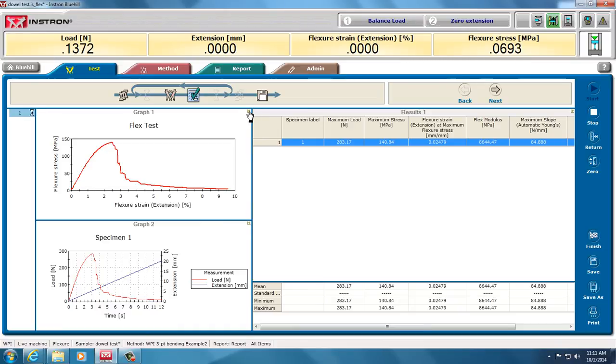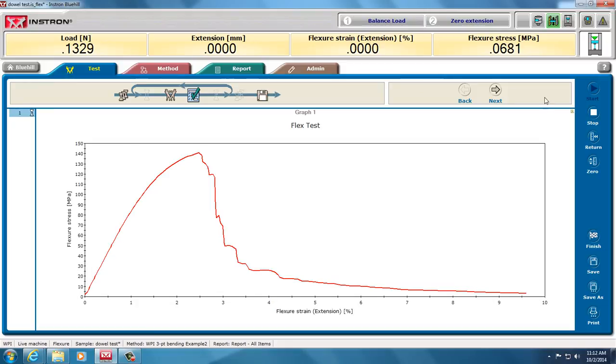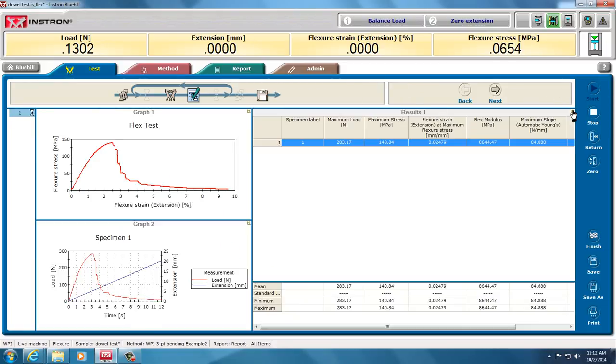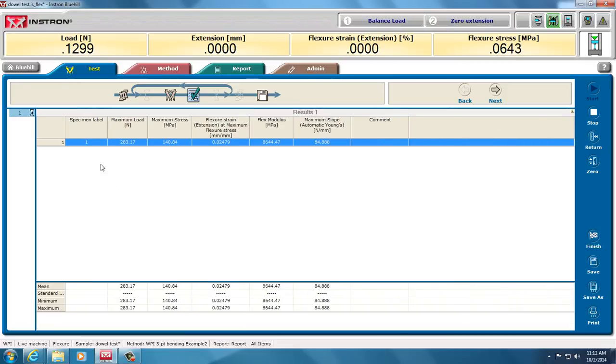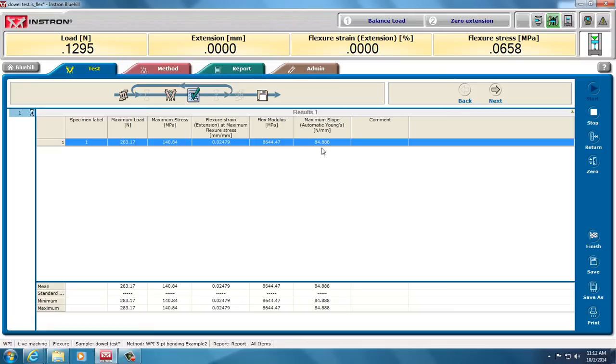In the method, I could have clicked on a button that told me that it would show me on the graph what the slope is, which would be the modulus. Minimize that. And I can look at my chart for my specimen. The max load was 283 newtons. The max stress was 140. So this is my ultimate tensile stress in flexion. The max flexural strain was about 2.5%. My modulus was about 8 gigapascals. And my slope of the stress-strain curve was about 85 newtons per millimeter.